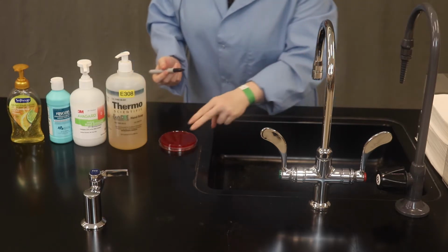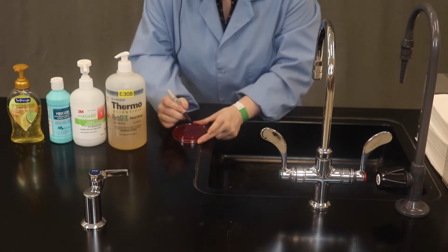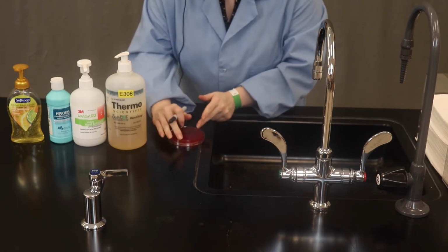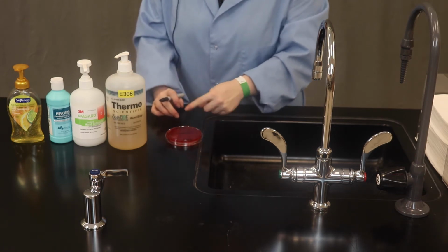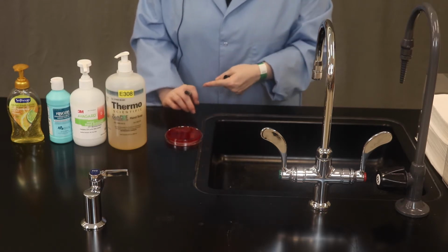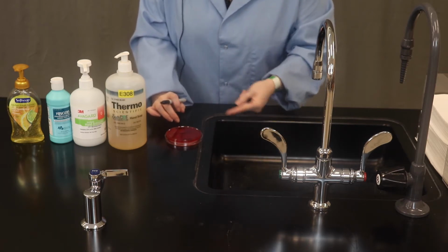I'm going to divide my plate down the center. On one half, I'm going to write "before," and on the other half, I'm going to write "after." This is going to represent hand washing before, so before I hand wash, and then after I hand wash. Then you are going to look at some examples of this and count the colonies before and after. We'll talk about this in lab later.